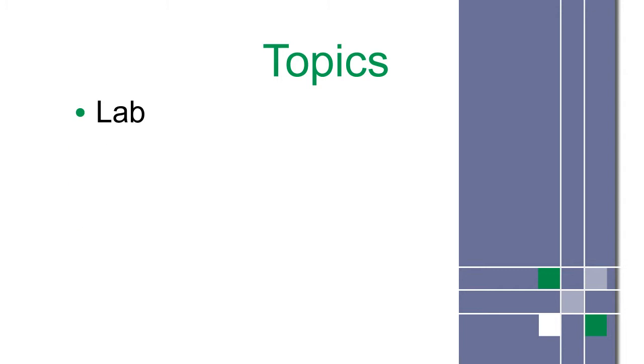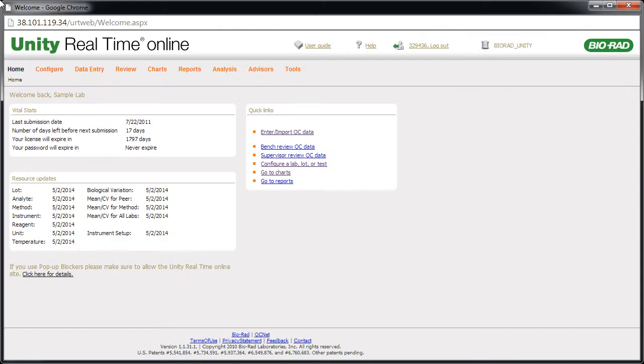We'll begin with lab setup. To navigate to the lab page, point to Configure and click Lab.